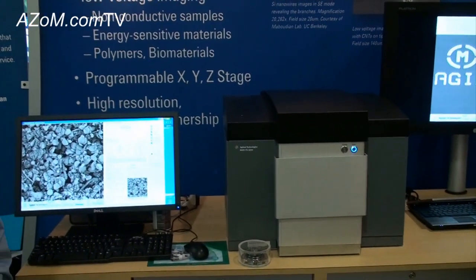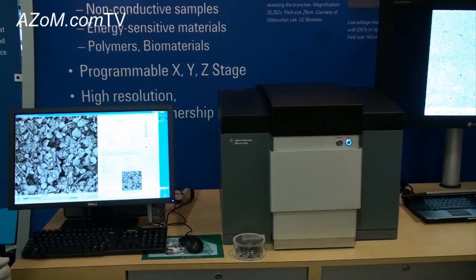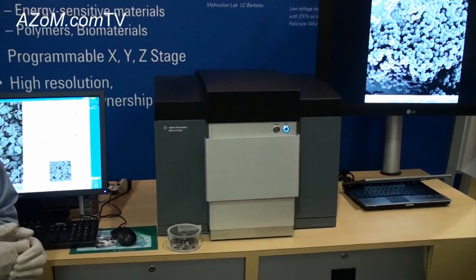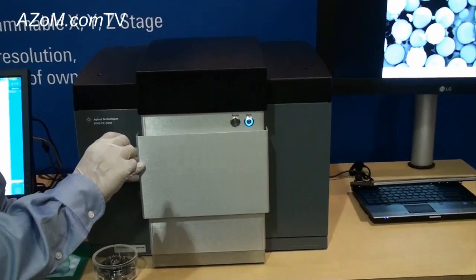How big are the samples you can look at in this system? Our sample holder can hold up to 60 millimeters by 100 millimeters in size, and the height is about 30 millimeters.